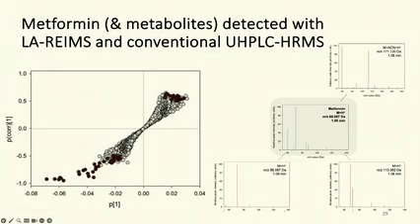What we also saw is that within our detected metabolites, there is a very distinct group of features that correlates quite highly with the diabetic group. And when we evaluated what it can be, it turned out to be metformin as such, and metabolization products, which is the medication that gets prescribed to treat diabetes. Interestingly, we saw those metabolites both with UHPLC and REIMS.